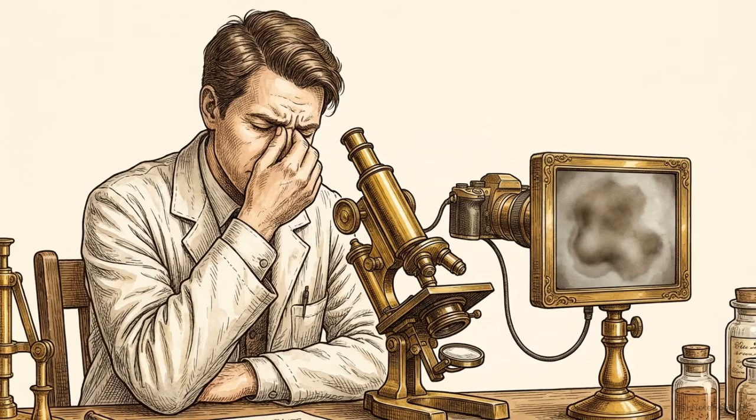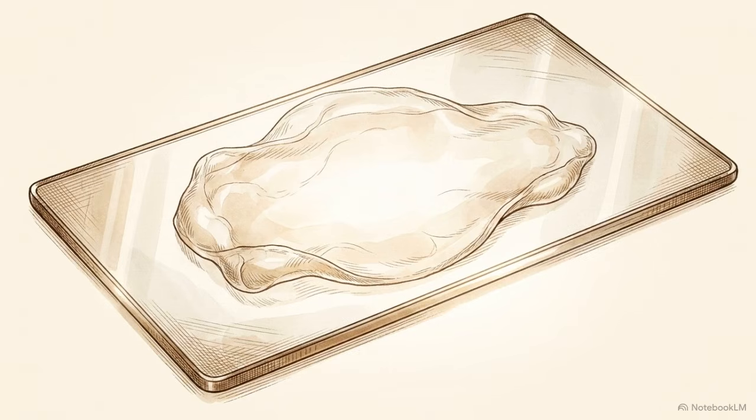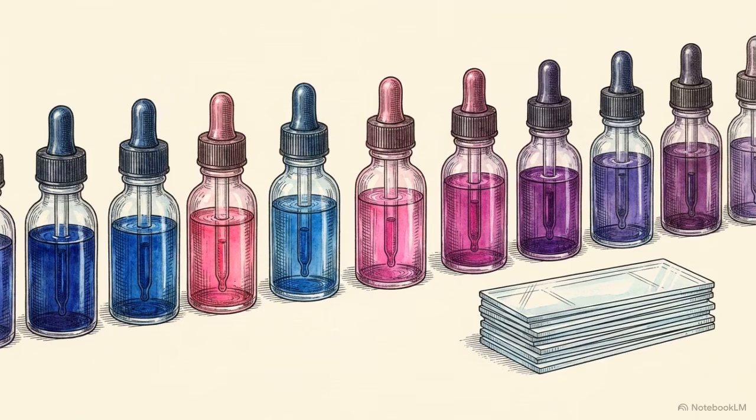But a perfectly engineered optical machine is useless on its own. You cannot simply throw raw tissue under a lens and expect to see clear details. The chemistry of the specimen is just as crucial as the physics of the glass.